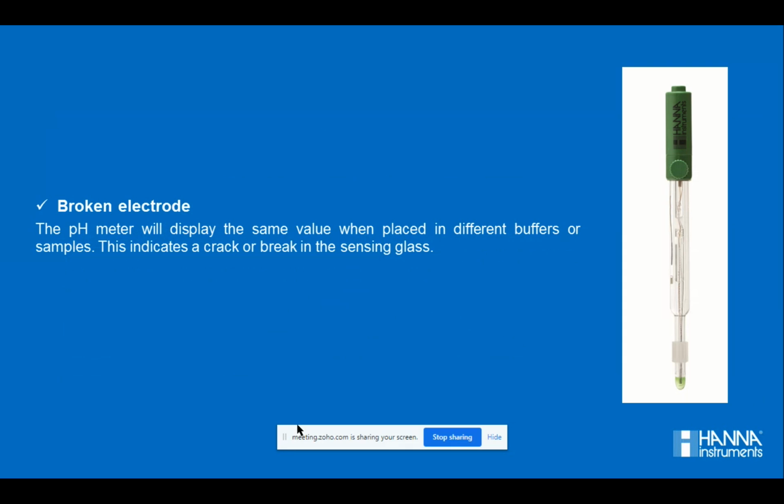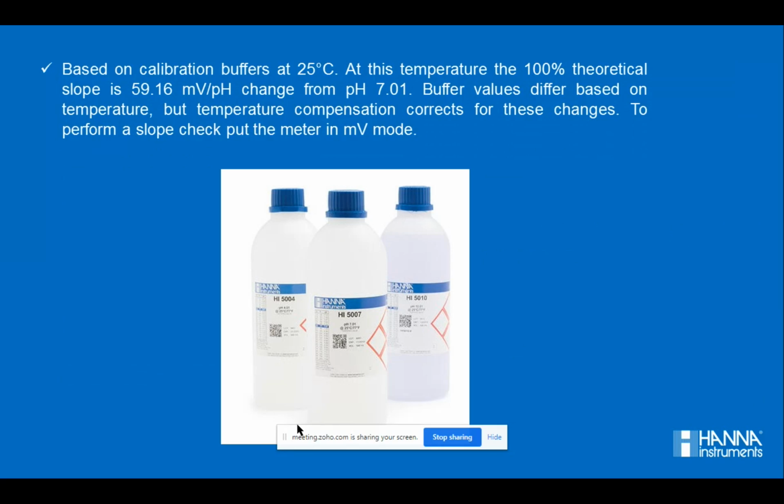Offset is nothing but the millivolt reading of the pH 7.01 buffer taken at 25 degrees centigrade. So this is the offset value. It is very important that you always note the offset and slope values after calibration, in order to keep your electrode and your buffers under observation. This will make sure that you always use fresh and accurate buffers for accurate calibration.